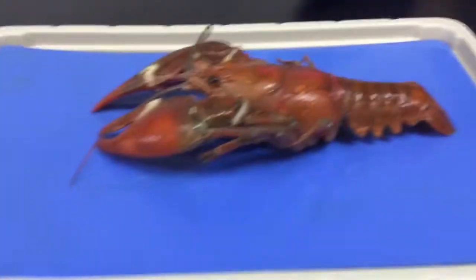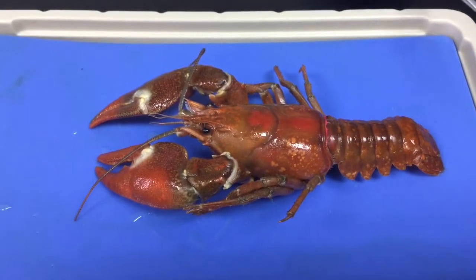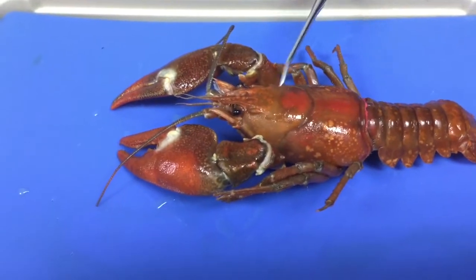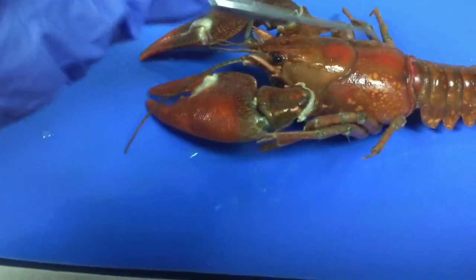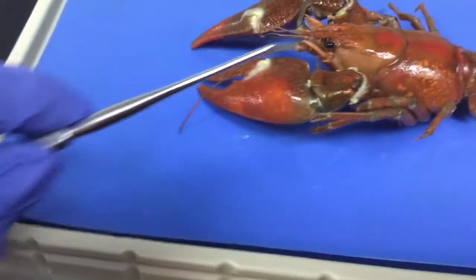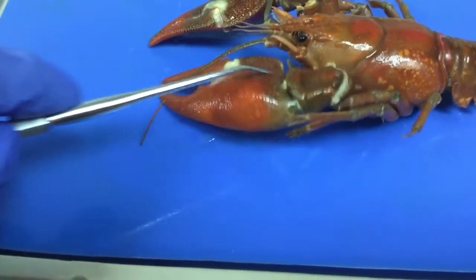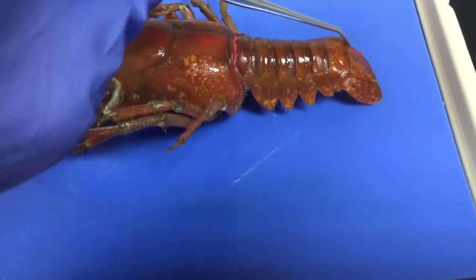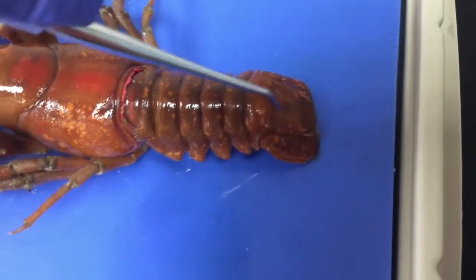Okay, we've got our dorsal side of our crayfish here, and we're going to identify the carapace. And so here's a carapace, and then the cervical groove, the compound eye, the cheliped we already identified, the walking legs, the abdomen, the uropod here. The middle section is called the telson, that little flipper.